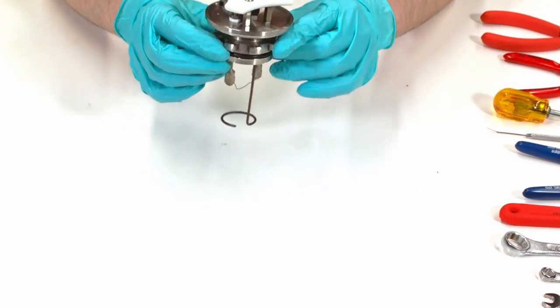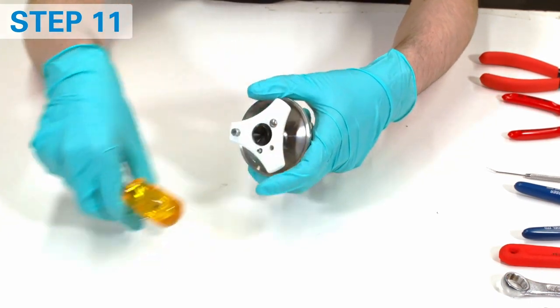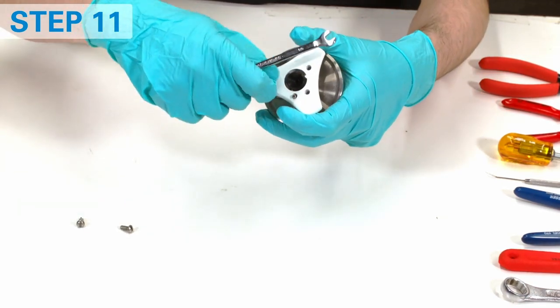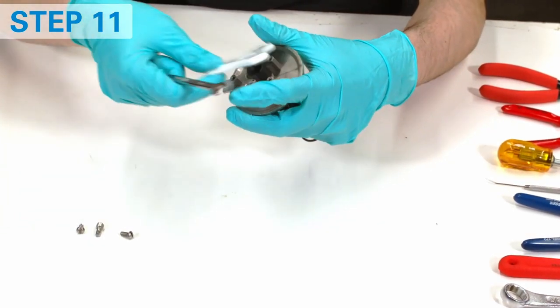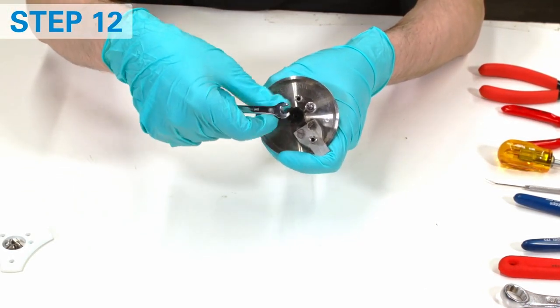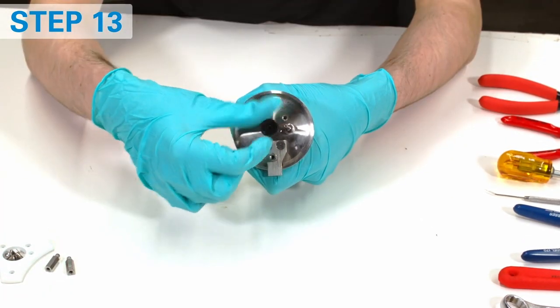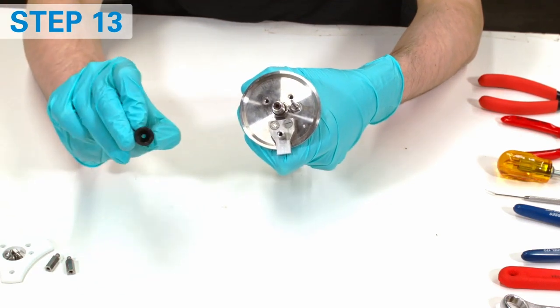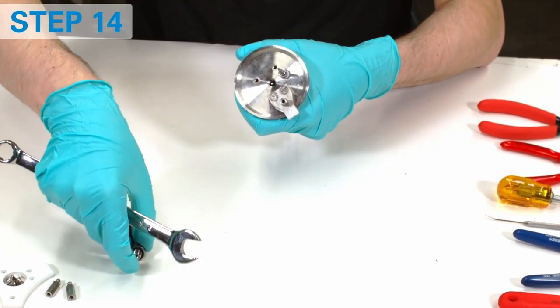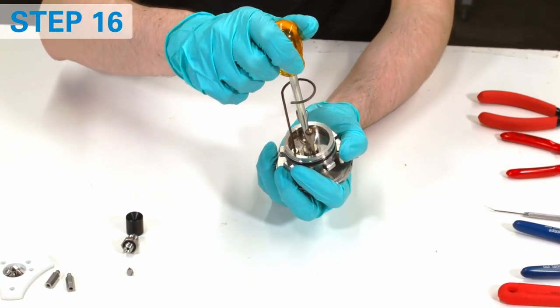Start with the vessel head. Remove the screws and the ground stud. Set aside the plastic handle. Now remove standoffs. Remove the funnel by hand. Remove the cap adapter and catch the check valve.